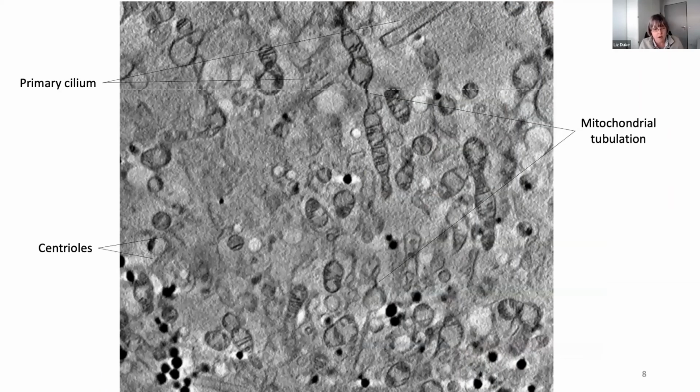And this is just a 2D slice from the three-dimensional data, showing you the carbon dense features in the cell. So anything that's particularly lipidic shows up very nicely, because the X-rays are absorbed by the carbon more than the surrounding oxygen, watery type features. And so you could see, for example, the mitochondria and the cristae inside that, and other features.